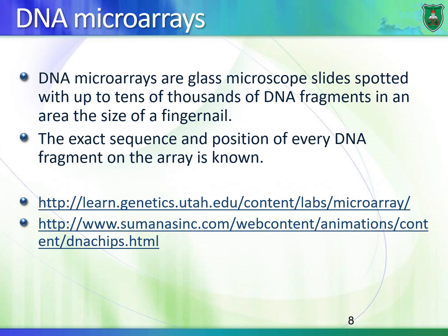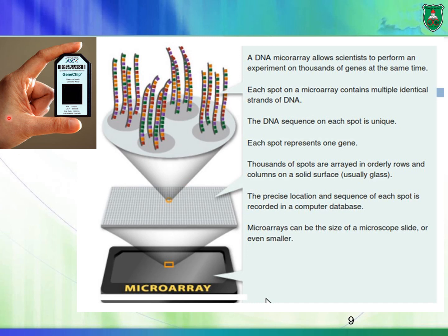مصفوفة. Okay? بالعربي مصفوفة. So a DNA microarray is basically a مصفوفة of DNA molecules. And it's really small. This microarray is really, really small. And this is how it looks like, right here. It's called a chip as well.